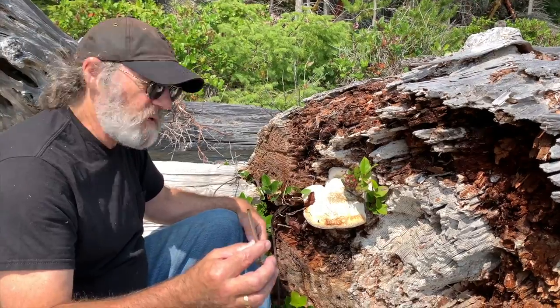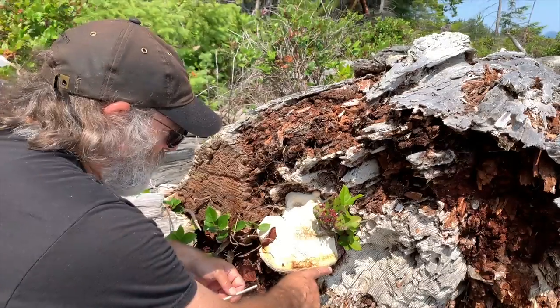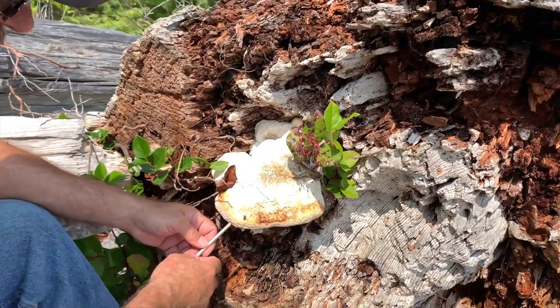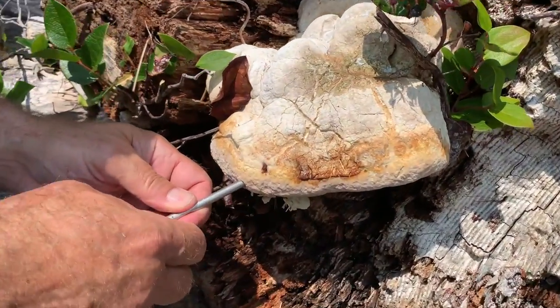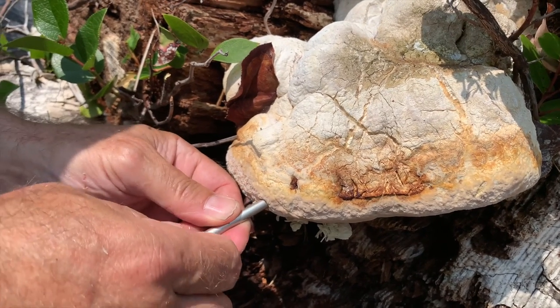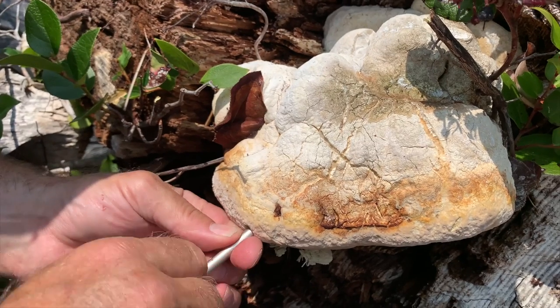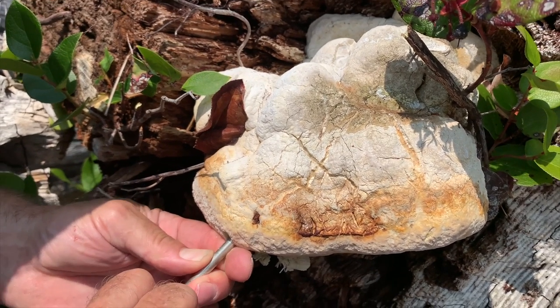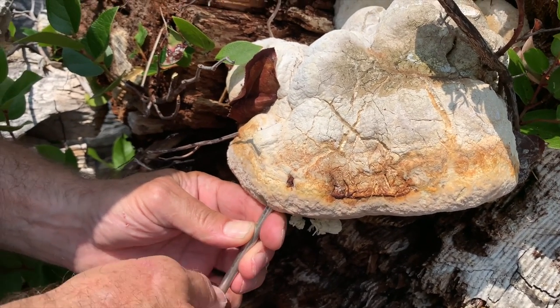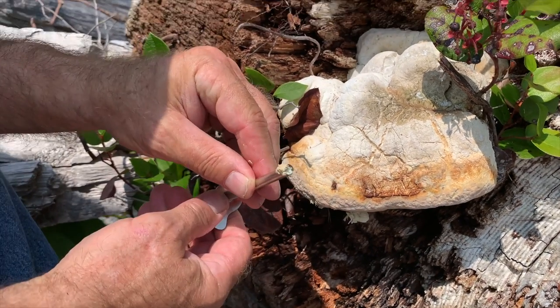I'm going to use a cork borer. This way I can leave the specimen here — I just need a small amount of tissue. One of the best places to clone is on the leading edge here, so I stick the cork borer in. It goes in a ways and I can feel it's a little bit hollow in the center, and I really want to pull out some tissue enough to clone. Let's see if this works. Yes, that's all I need.